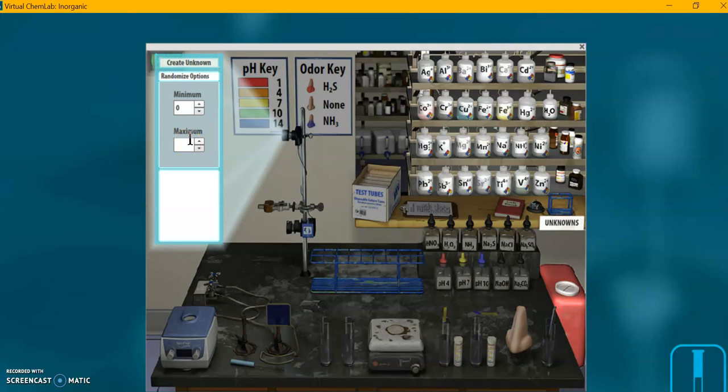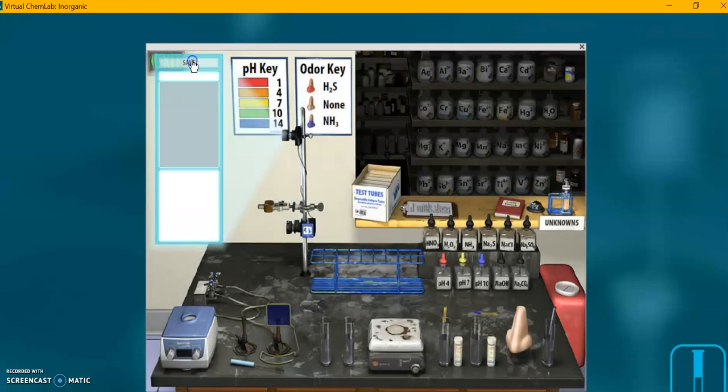And the worksheet also says to change these to a minimum of zero, maximum of four, meaning that our practice unknown will have up to four, all four of those ions. Or none of them could just be water. Or one, two, or three.